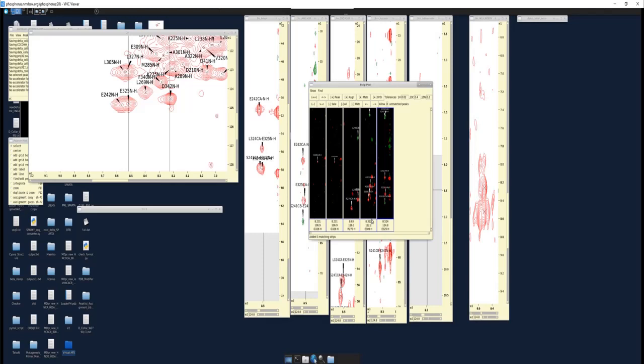It is not guaranteed that it's the I-1 or I+1. So you should always use the triple resonance to find your matches and then simply use the NOESY to confirm or help narrow down your searches within those matches. Now there's another way you can use your NOESY as well.